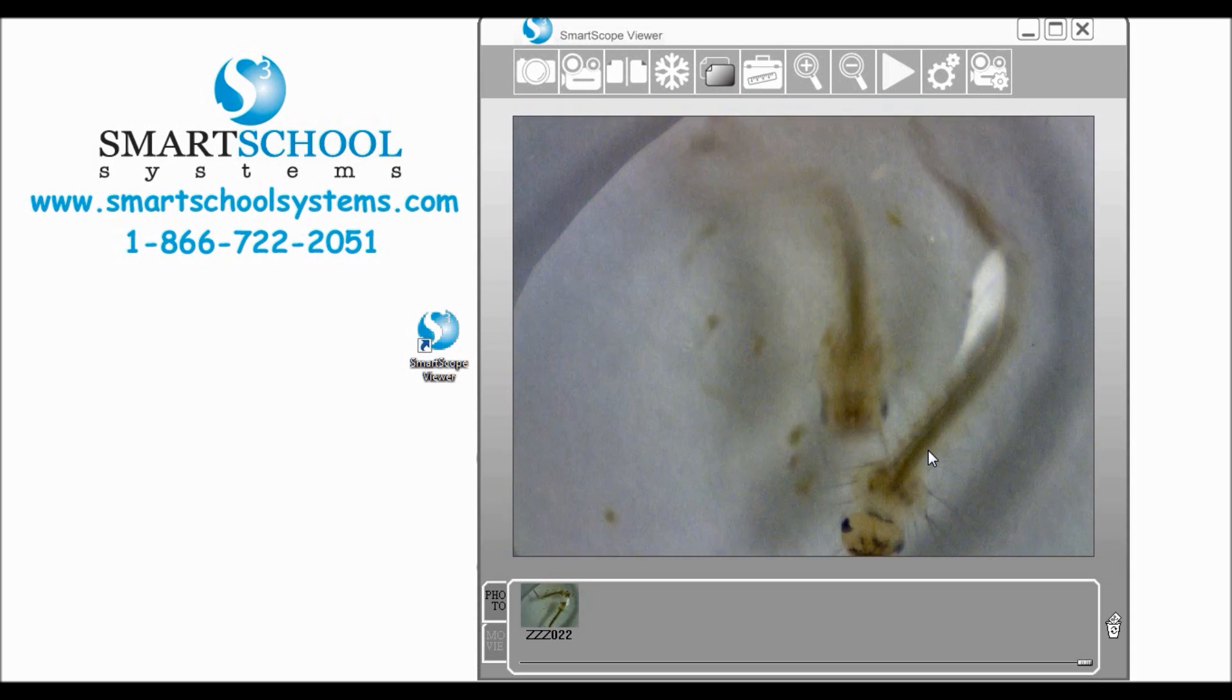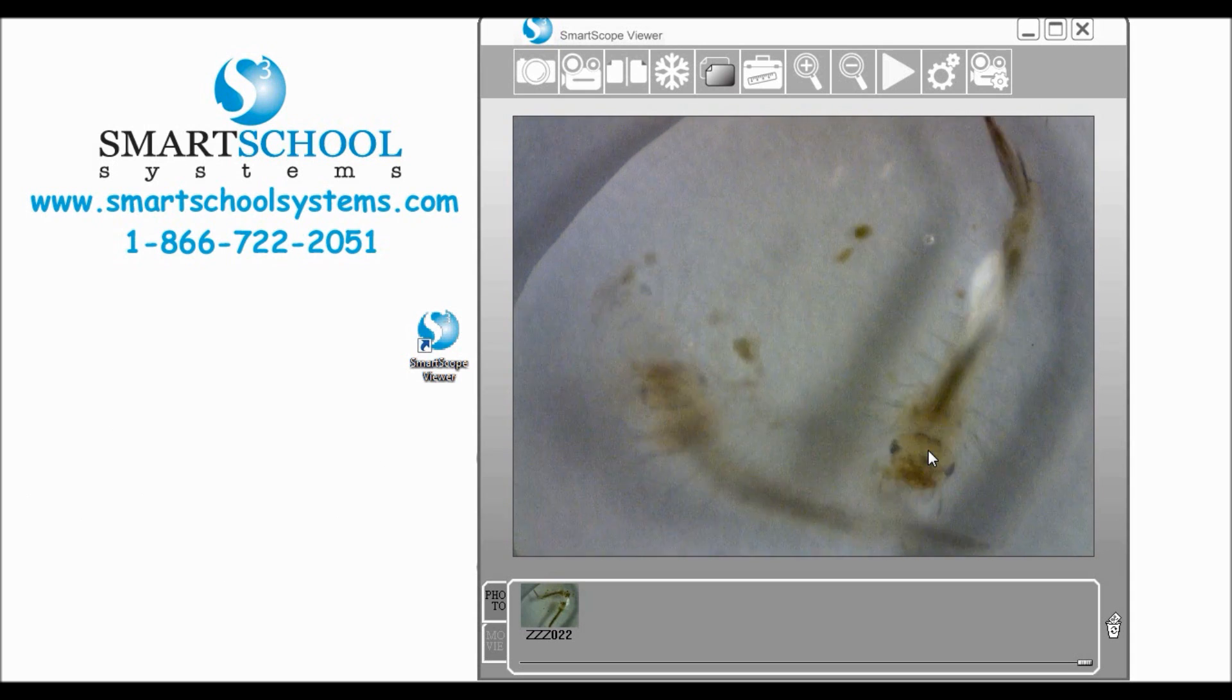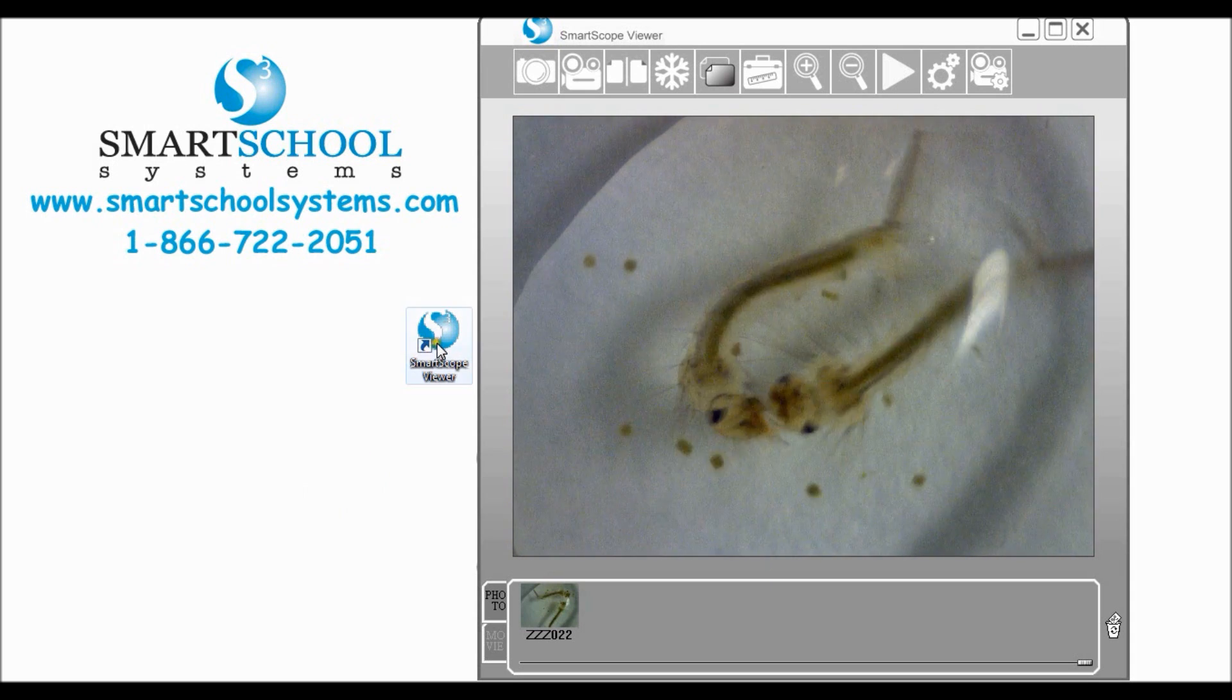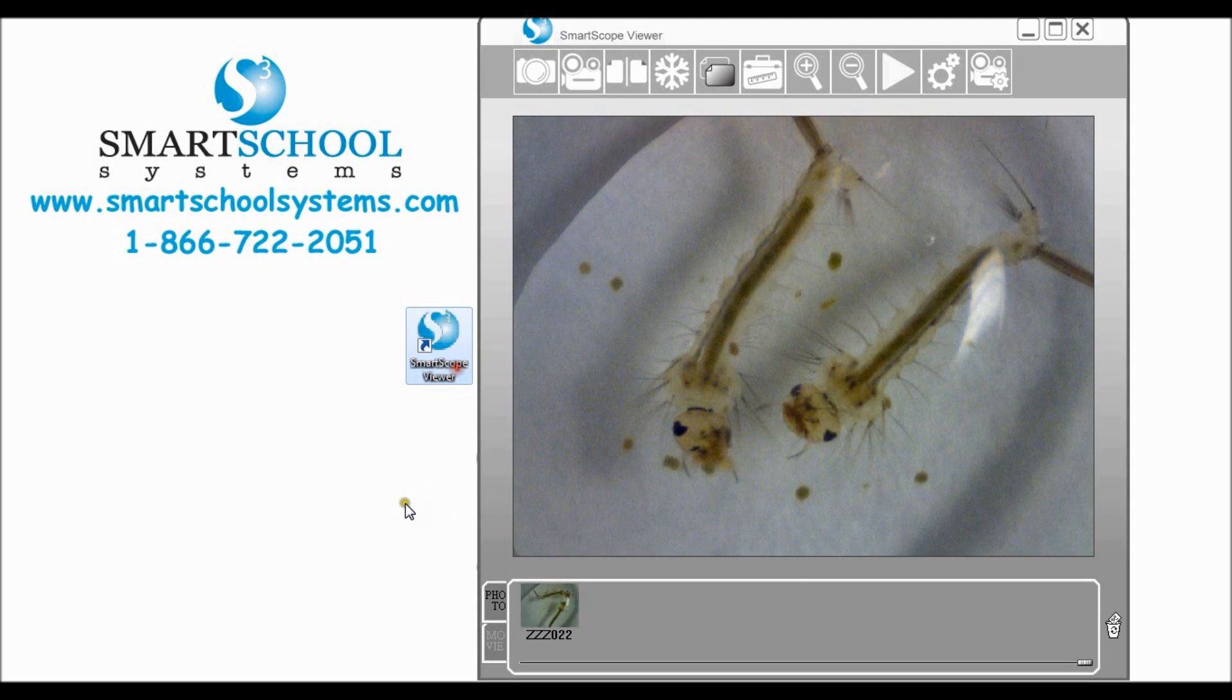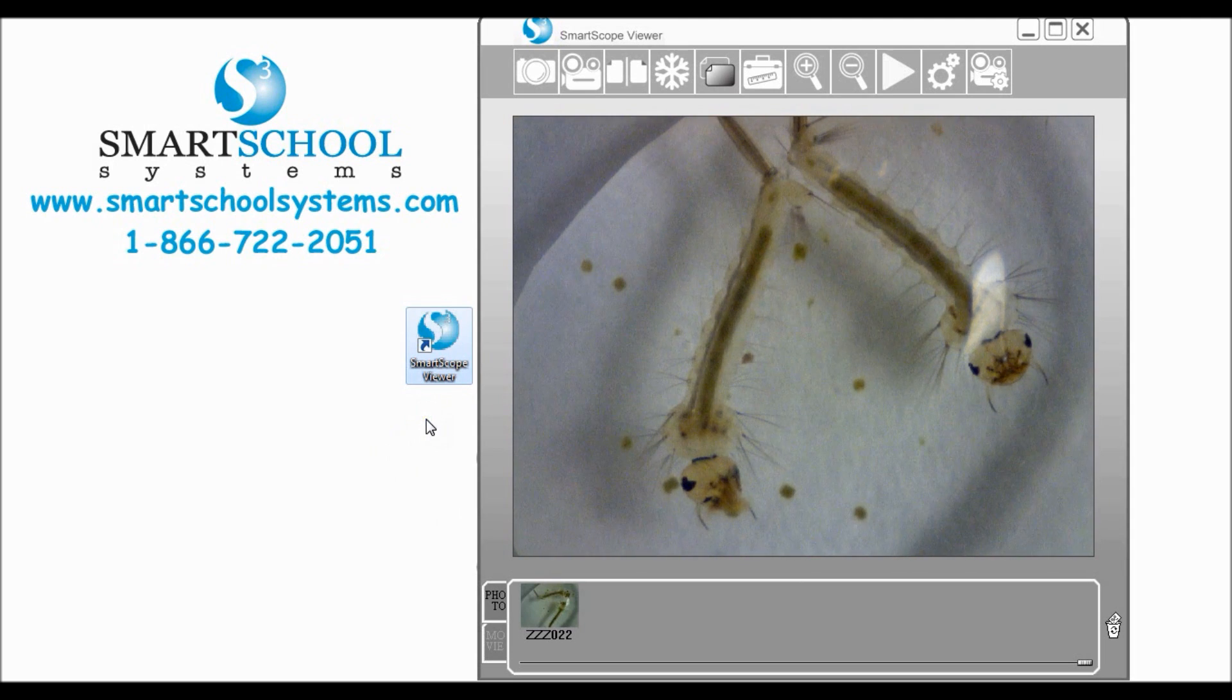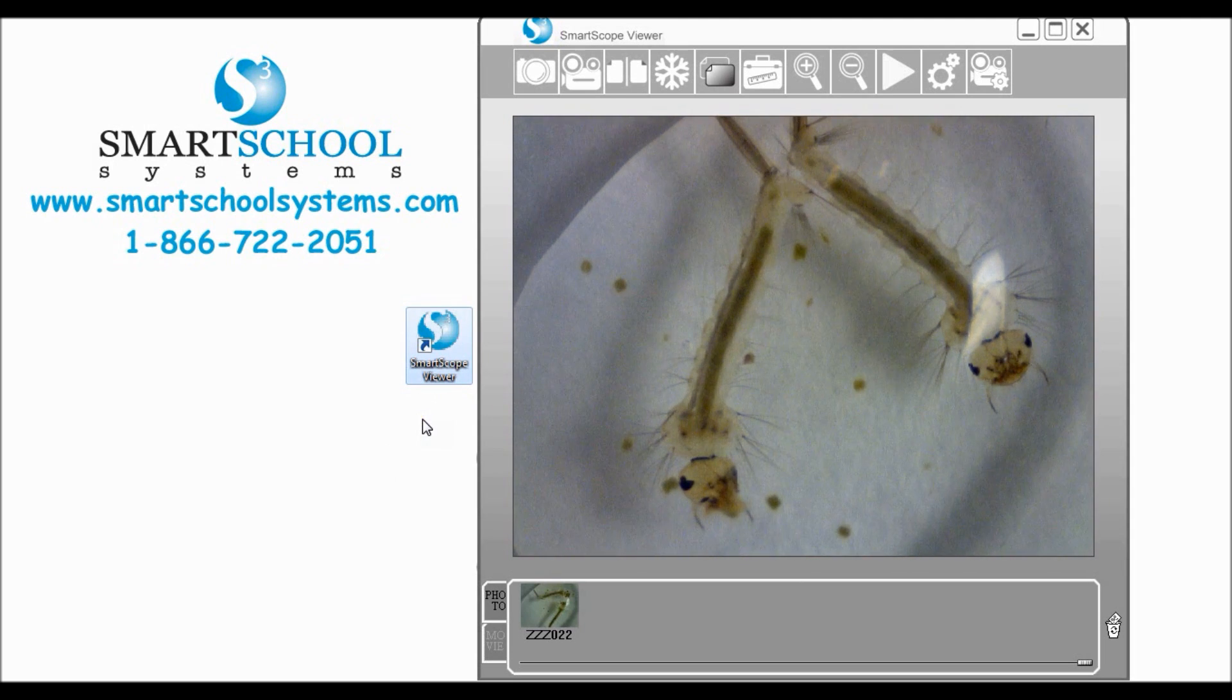Plug your SmartScope into the USB port on the computer, then go to your desktop and find the SmartScope Viewer icon and double click it.